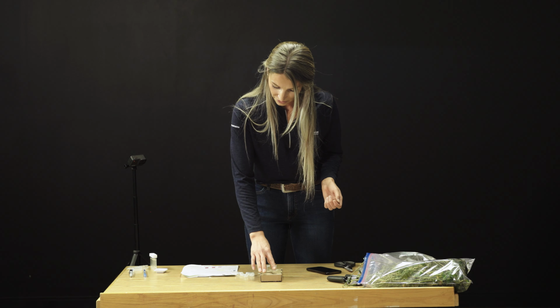Once you have covered each of these and secured them, you mix vigorously and then let sit for 5 minutes.